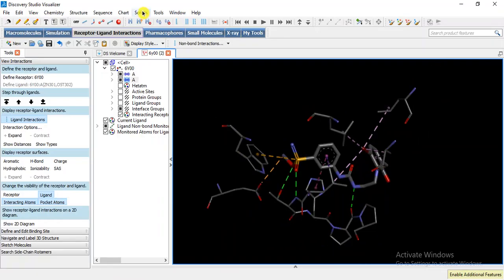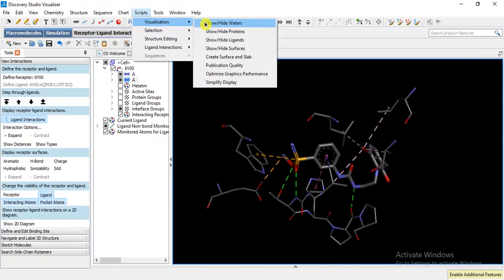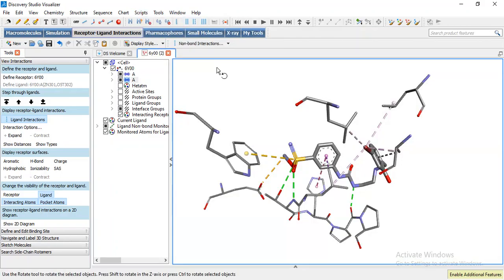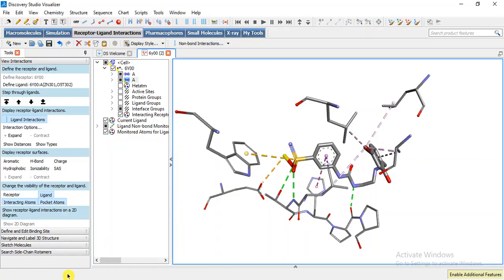We have to go to visualization and publication quality. Now it contains zinc interaction that we can observe from the right corner.